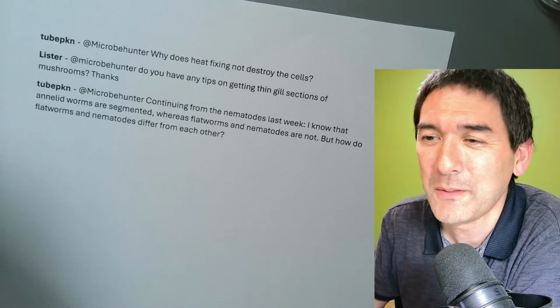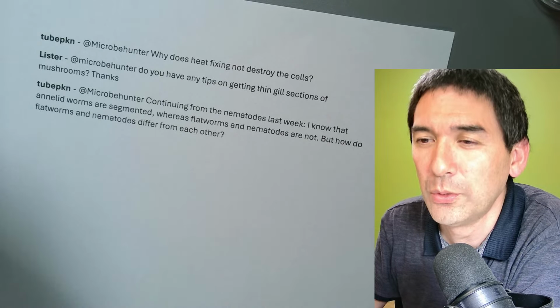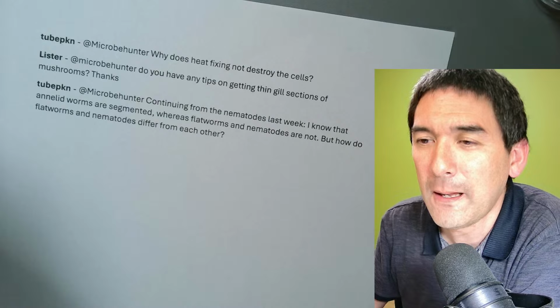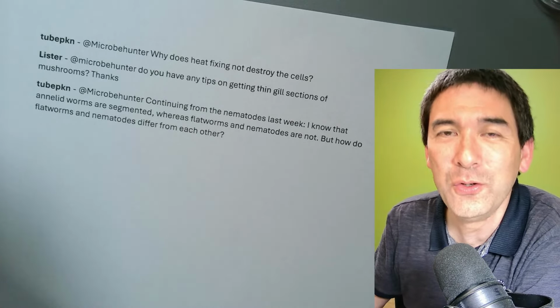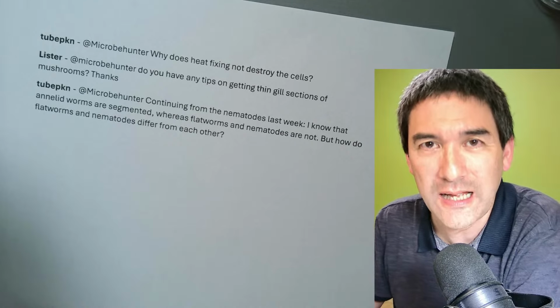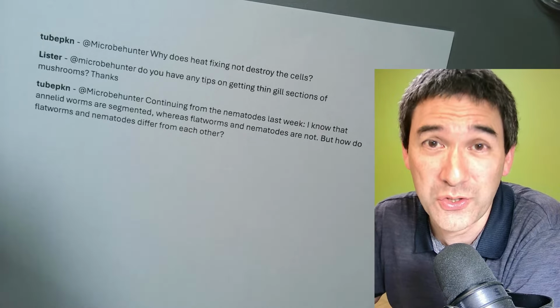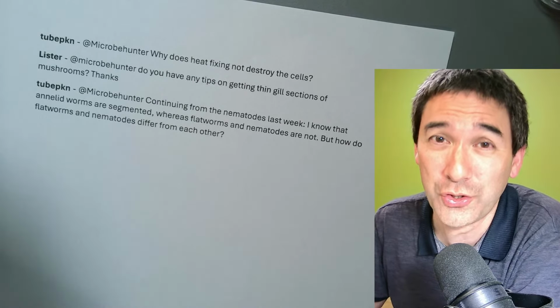Maybe you should also show the cleaning process of the... I've done this now. Would it be impossible to have algae without any contaminants? Well, let's put it this way. If you are doing research at a laboratory, at university, and I've been doing research in bacteriology, you have to work with pure cultures.